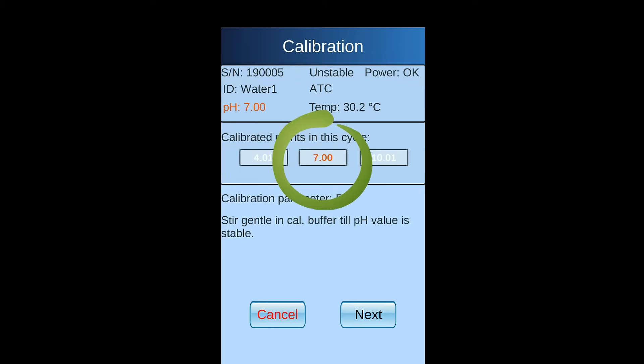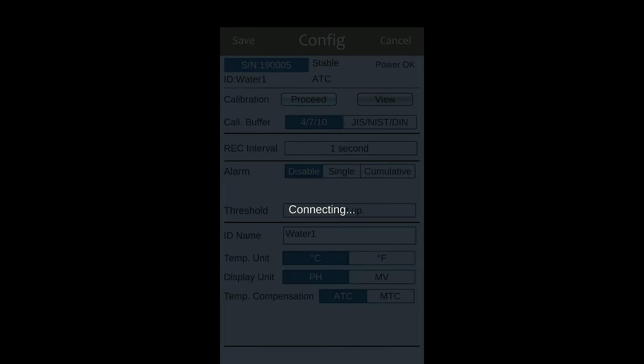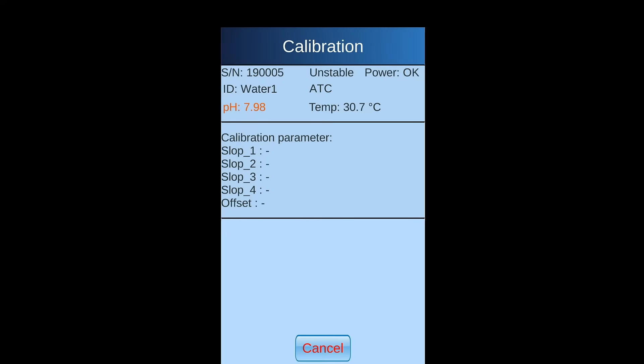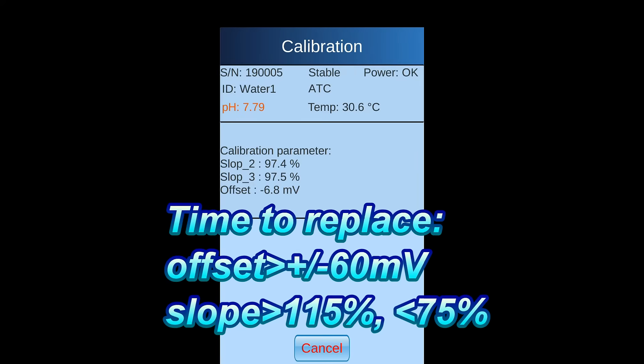You will then see 7.0 has been marked as calibrated point in first page. A function called view is to let you know the health status of PH pen. While the offset is below minus 60 millivolts or above 60 millivolts, or slope is below 75% or above 115%, it is suggested to get a new PH pen.